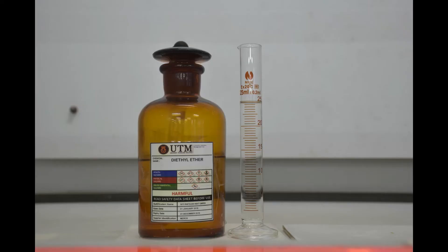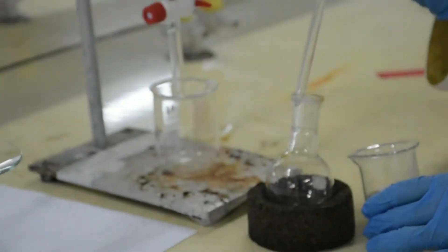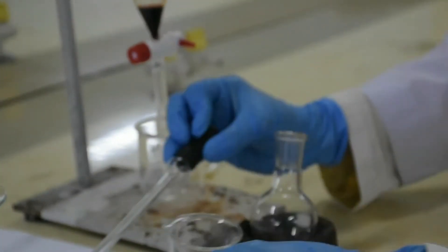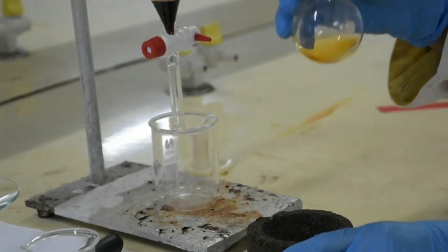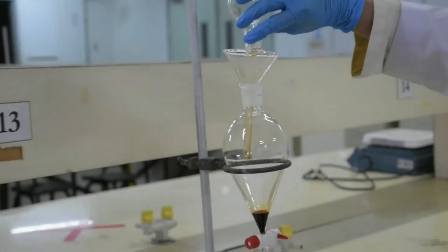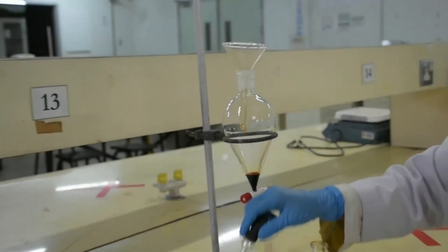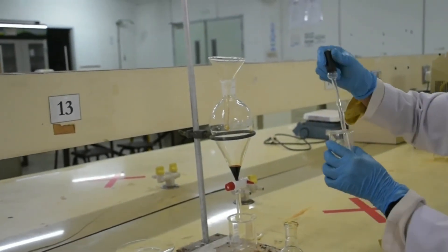Measure 25 ml of ether at the fume hood. Rinse the round bottom flask using ether and pour it into the separatory funnel. Pour the remaining ether into the separatory funnel and observe the formation of two layers.